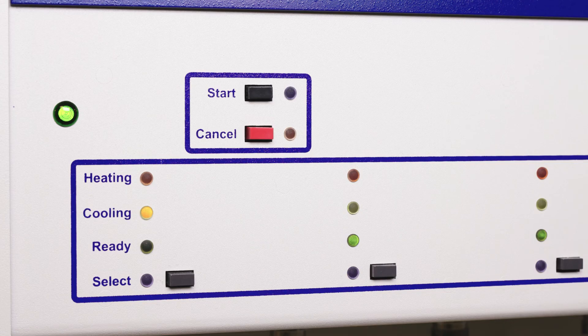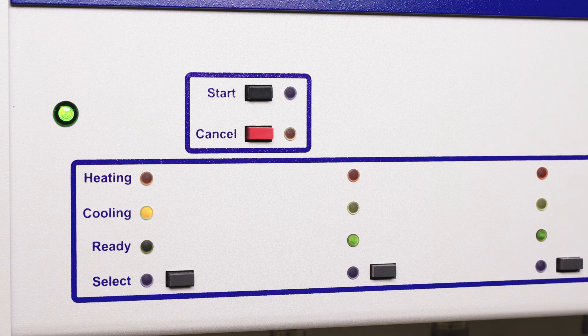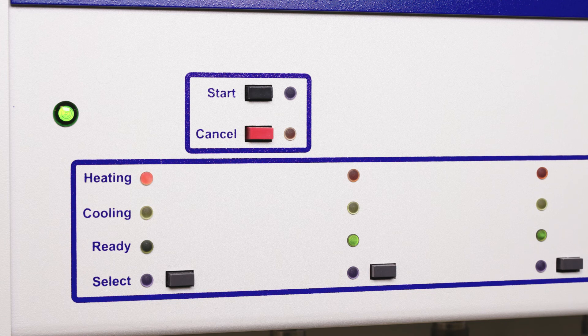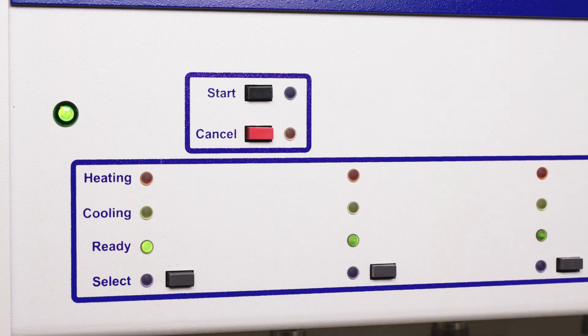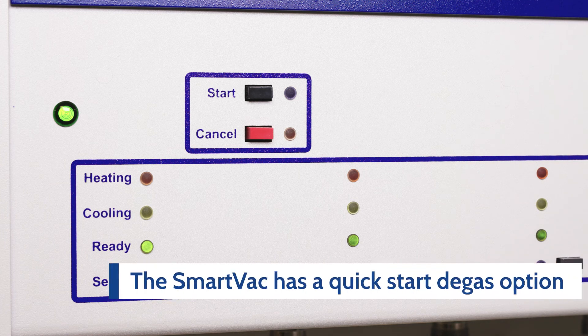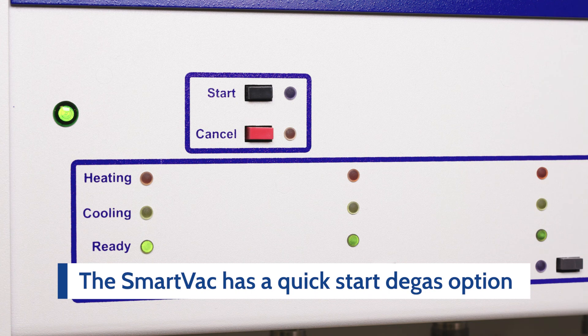On the SmartVacPrep, there are also lights to indicate the status of degas. The orange light blinks when evacuating and cooling and the red light when ramping and degassing. Once the sample tube is cooled down, the green light will be on to indicate the degas is complete.